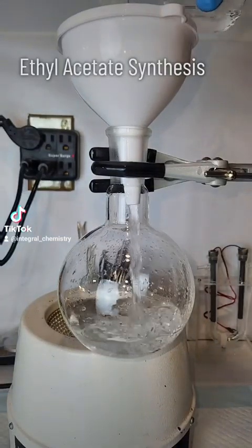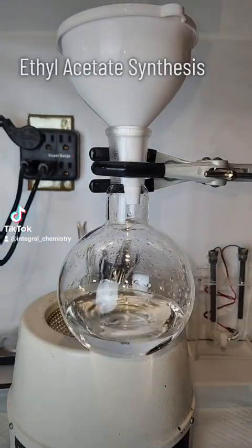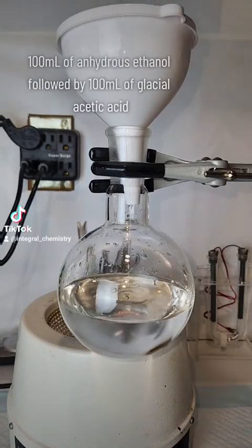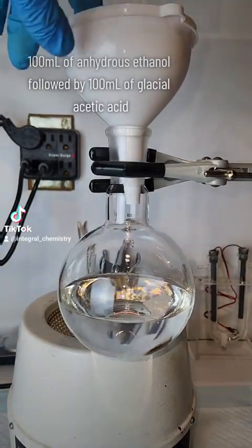Today I'm going to synthesize ethyl acetate, which is a powerful and water-immiscible solvent. I typically use it as a non-toxic alternative to DCM, as it has many of the same properties.